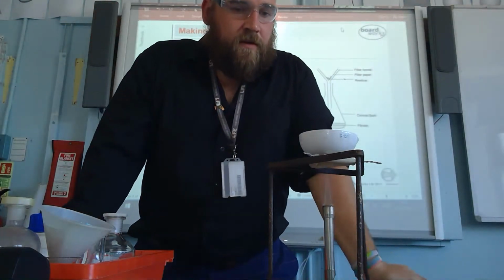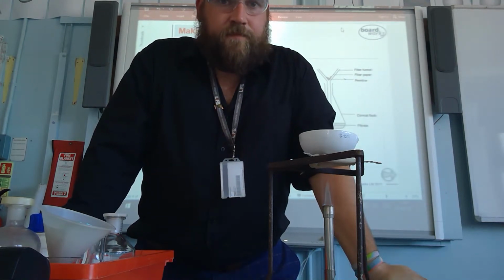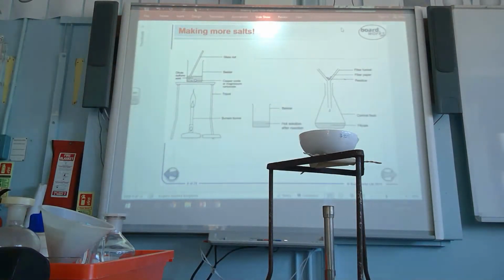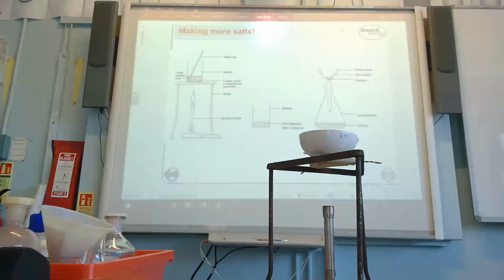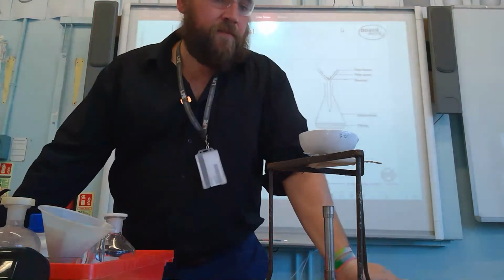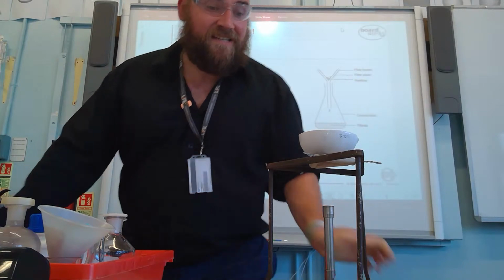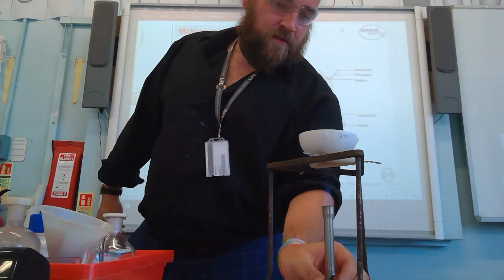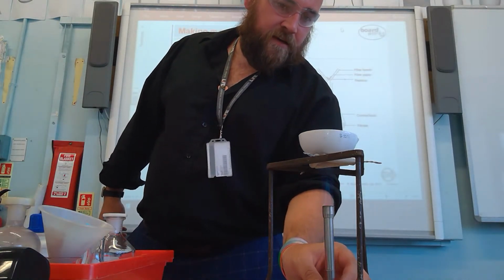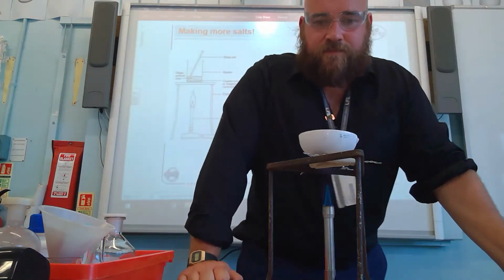Yeah. And it's just about to bubble. So I think I saw my first bubble just then. It's not easy with the lights on for this one because it is a colourless solution. So seeing them boil is a little bit trickier. Imagine lemonade versus Coca-Cola. Which one's easier to see bubbles in? So go half and half, get a nice steady simmer. All right.